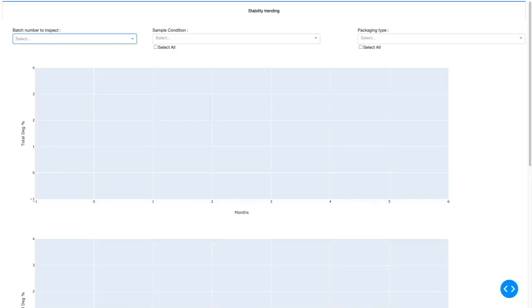So we have already ingested most of our LIMS system and constructed a semantic layer around it. Now I can pull the verified data through an SQL query, do a little bit of cleaning and data science magic, and now we have a dashboard, which is a web app, easily accessible to any associate.